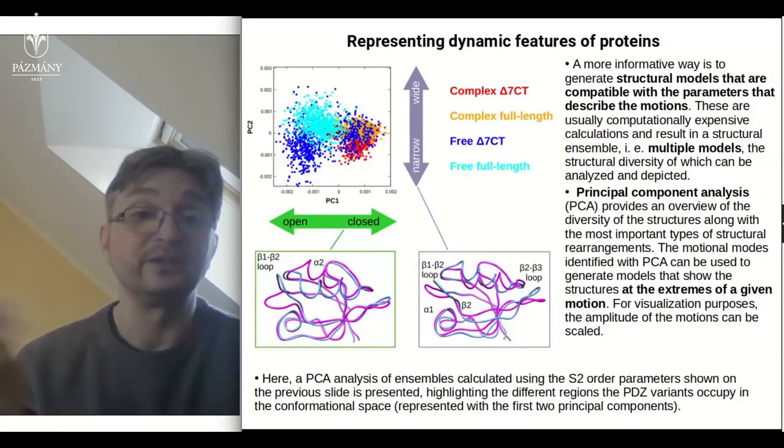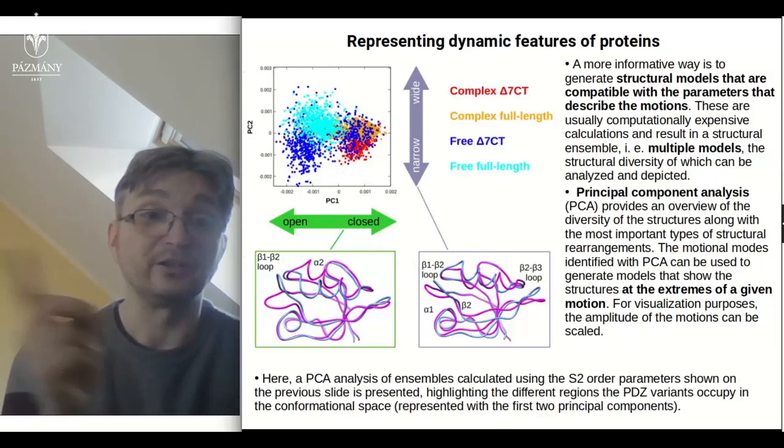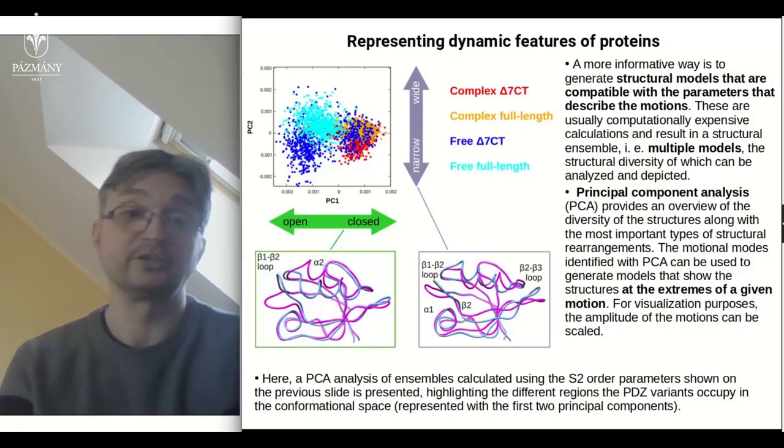Okay, so here we can identify the type or nature of the given motions and to what extent the given proteins occupy the region along the given motion.